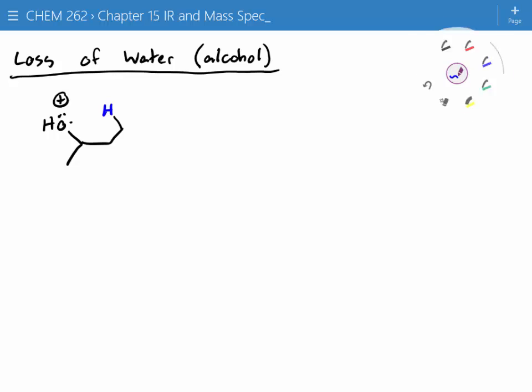What will happen is we'll get a really quick rearrangement. This will take one electron. This will pop over, and then we're going to move both electrons up to this oxygen. So it's a very unusual rearrangement that involves movement of not only single electrons as radicals, but a set of electrons too. So that oxygen-carbon bond, we're moving both electrons.